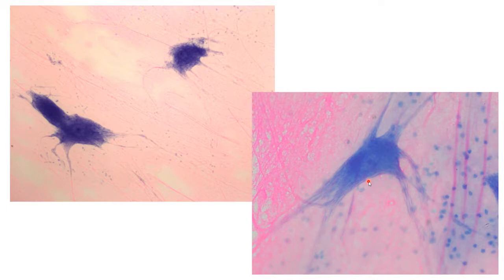What's in the middle of the nucleus? Yeah, that little thing called the nucleolus. If you look really close at a neuron, its nucleus and its nucleolus kind of looks like an eye. So you can kind of see it a little bit on this one too, the lighter colored nucleus and then the dark nucleolus in the middle.